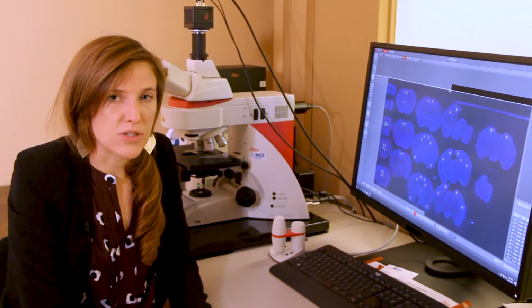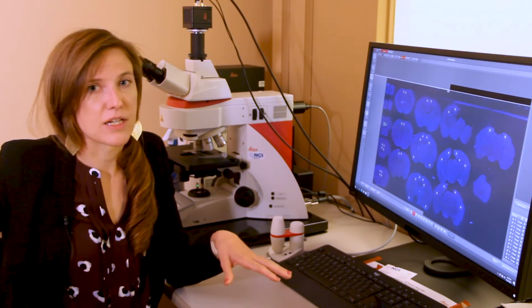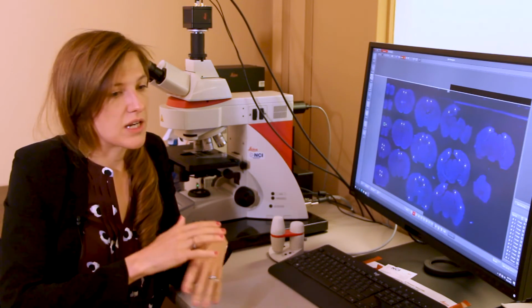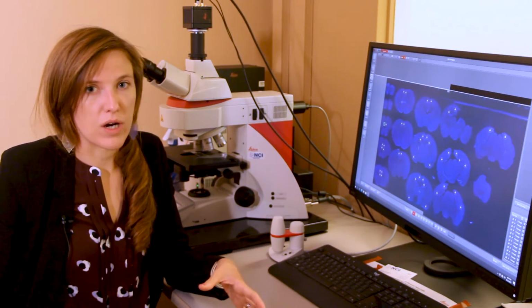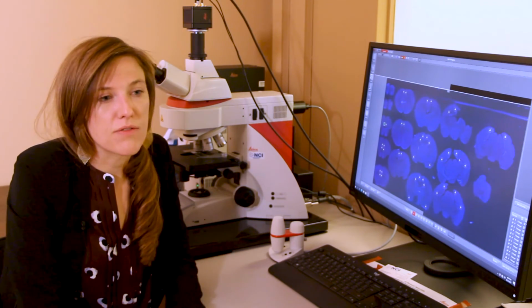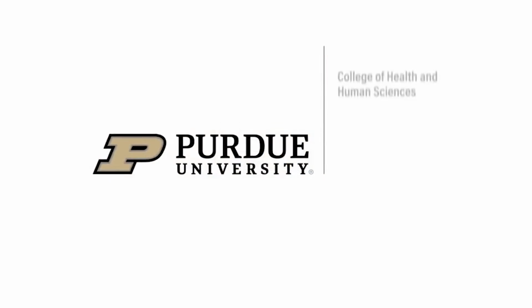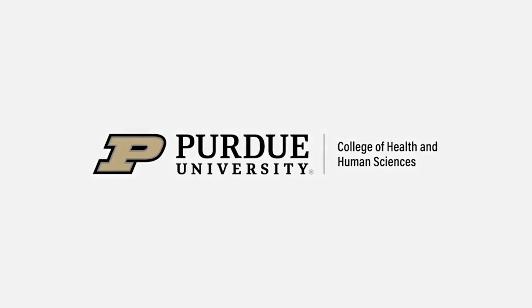And what's really interesting about this is that I can have these pictures taken concurrently so that we're getting a whole bunch of data all at once. This allows us to map the entire brain in a way that on previous microscopes and other typical fluorescent scopes would have taken months to do. I can do it in a matter of days here.